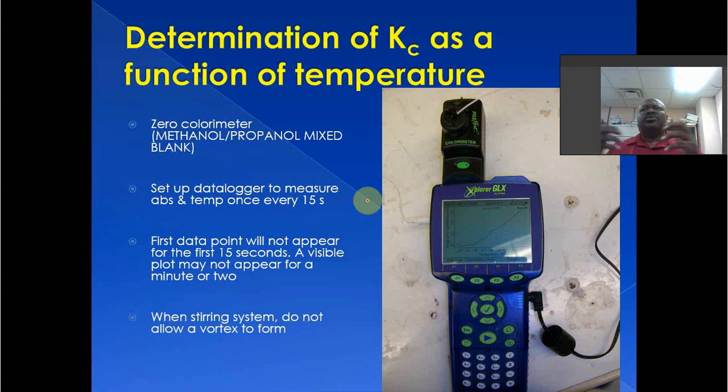Well, not a regular ice bath, a dry ice acetone bath. Dry ice and acetone, make a slush of that. The temperature is very cold. Minus 50. Actually, I don't know what it is. Minus 40, it's some low number. Really low. Minus 50. Hey, you can Google it up and find out.